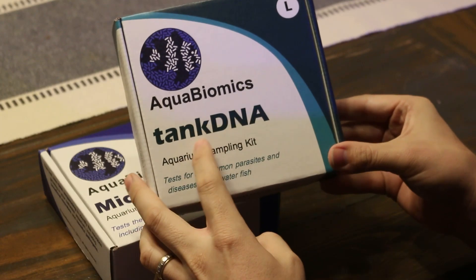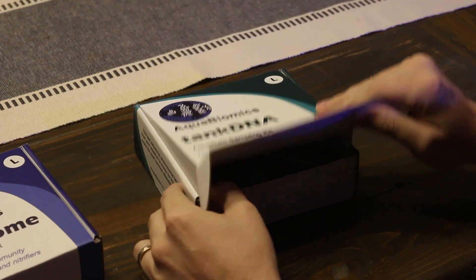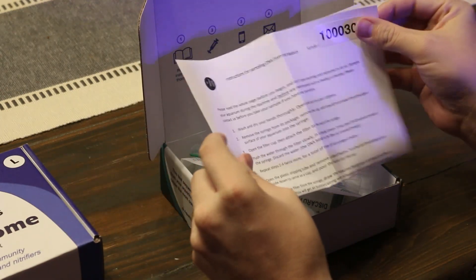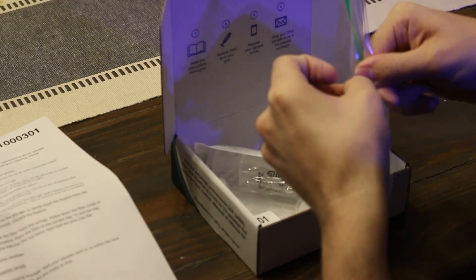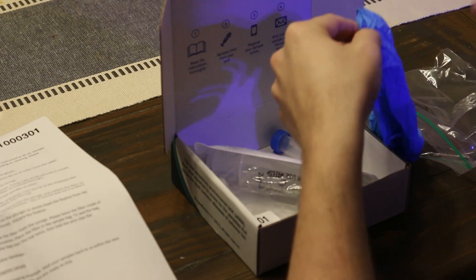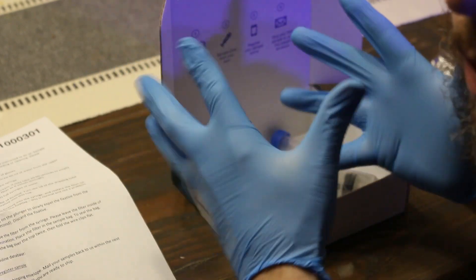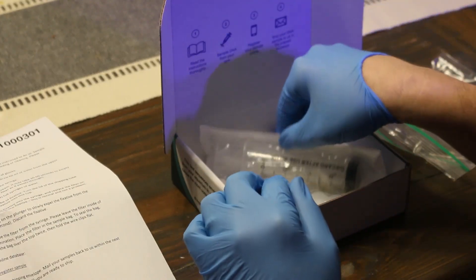I got started with the tank DNA test first. Upon opening the test kit you'll notice the instructions, and it says right away to thoroughly read the instructions — I read them over a few times and had them laying out as I was doing the test. You want to make sure you wash your hands thoroughly, then once you've washed your hands you can open up the included pair of gloves and put those on.